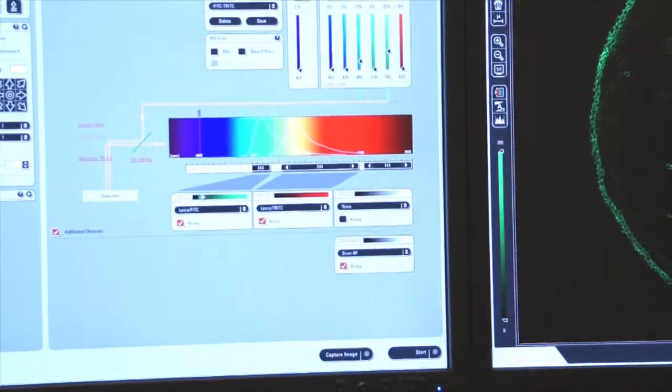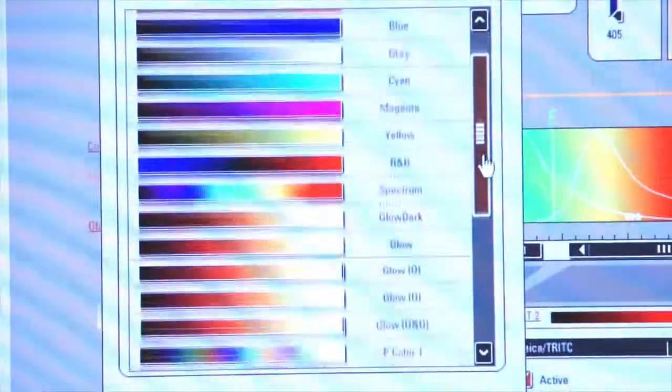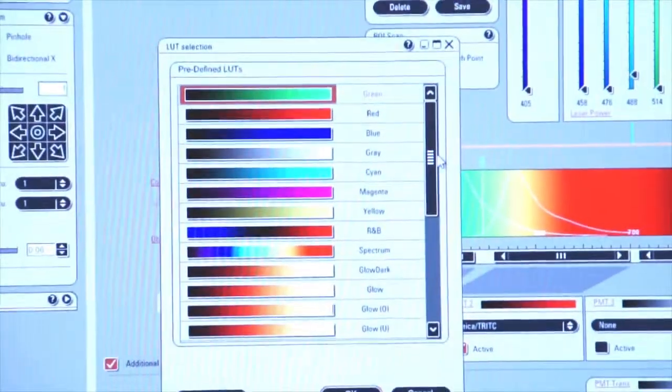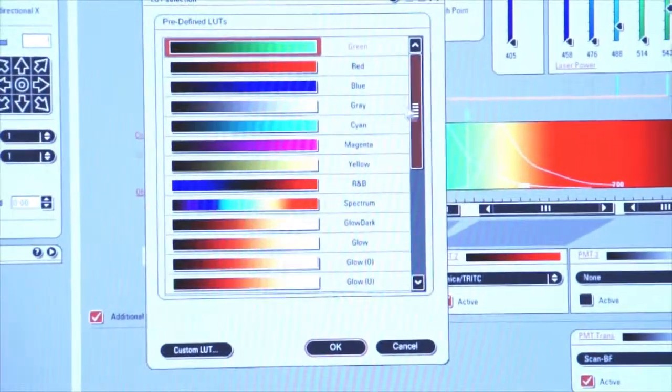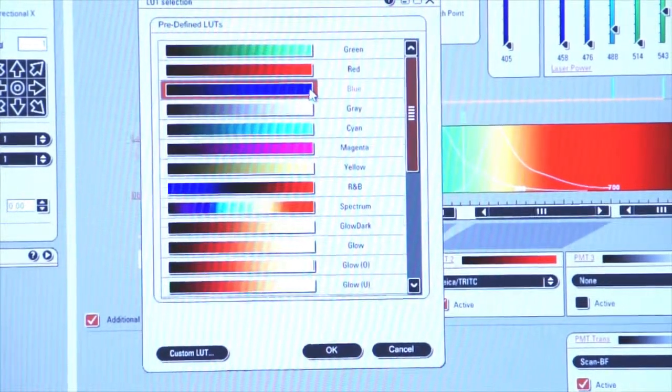And now if I click on this color band on PMT1, I can select the particular color that I'm interested in. I already have green. Let's select blue. And I click OK.